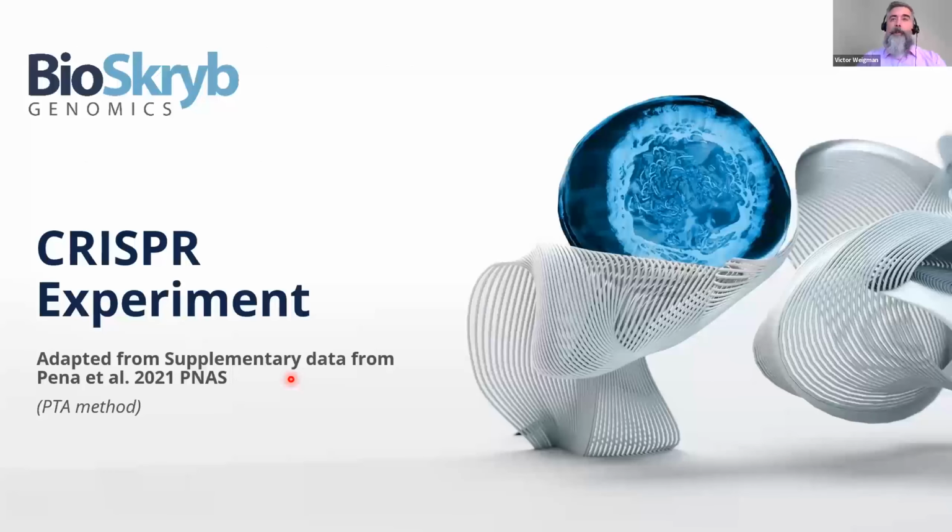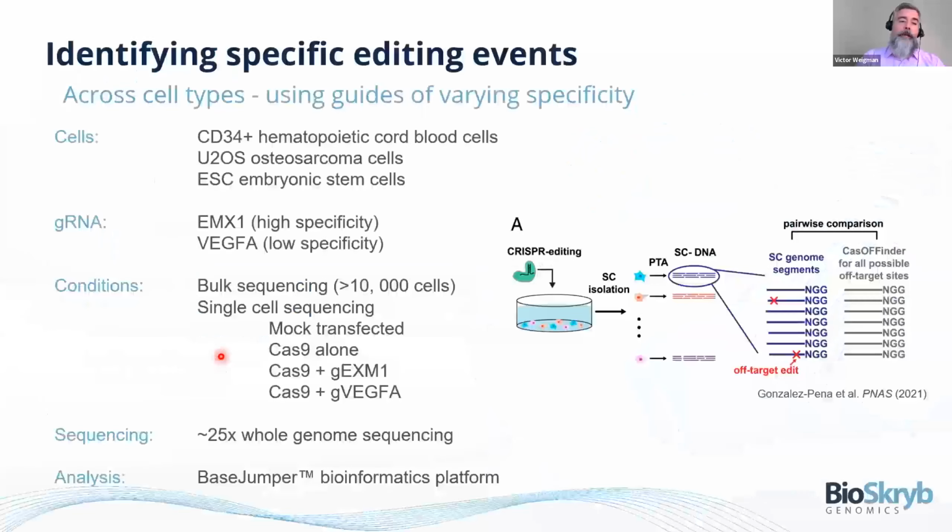So what I'm sharing with you today is research that was actually done as a supplement from the Pena et al. paper in 2021 in PNAS that really launched the PTA method. I encourage you to give that a read if you have not. And certainly the data I'm showing here, you see the core concepts of that in that paper.